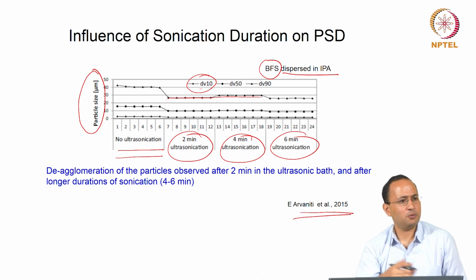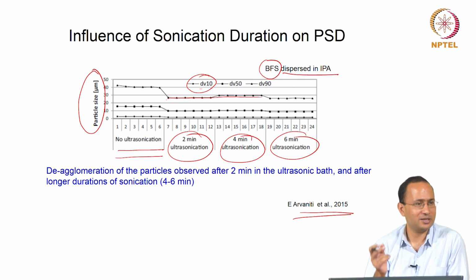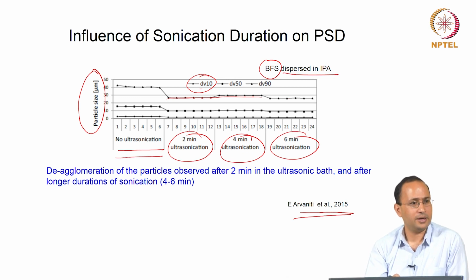This is for slag, so it will range from less than a micron to hundreds of microns. So do we need to worry about the brittleness of single particles? Maybe the large particles may have some issue in some cases, like if you are talking about 500 microns, when we are going to the higher end, it might be an issue, but that needs to be checked. Actually, there was an issue with this: after ultrasonication, there is a change. Yeah, it's possible, so you have to be aware of that.